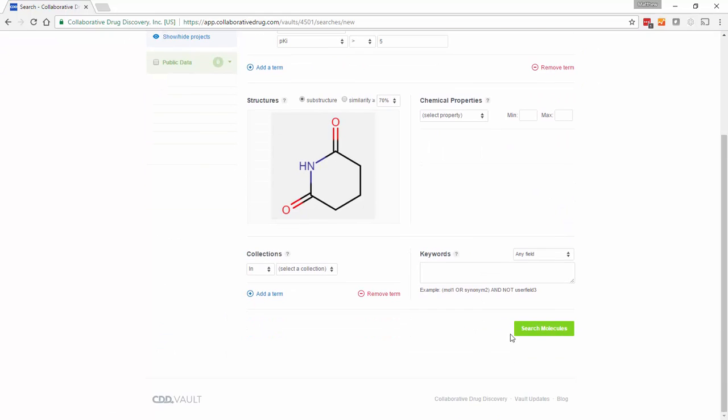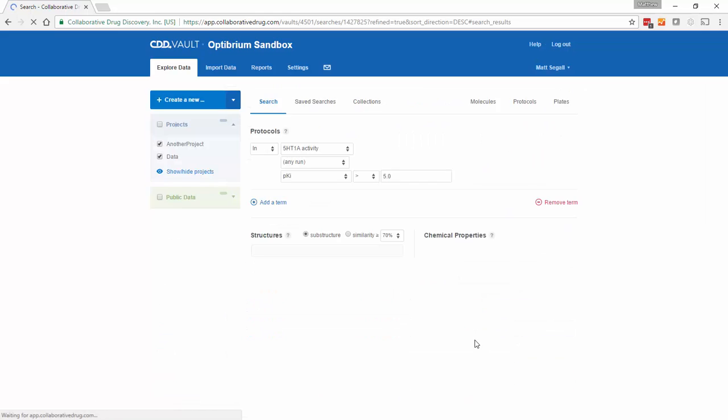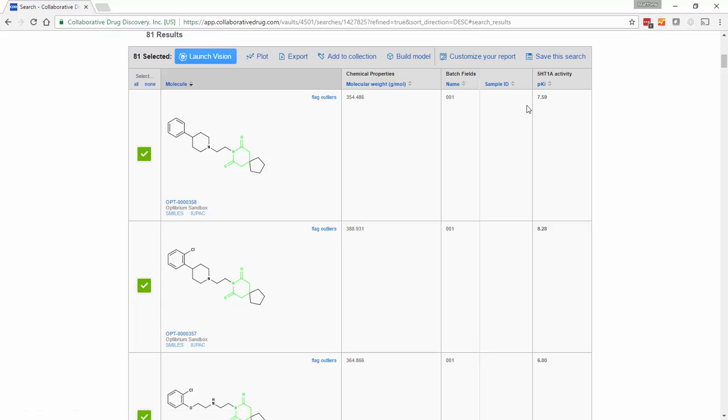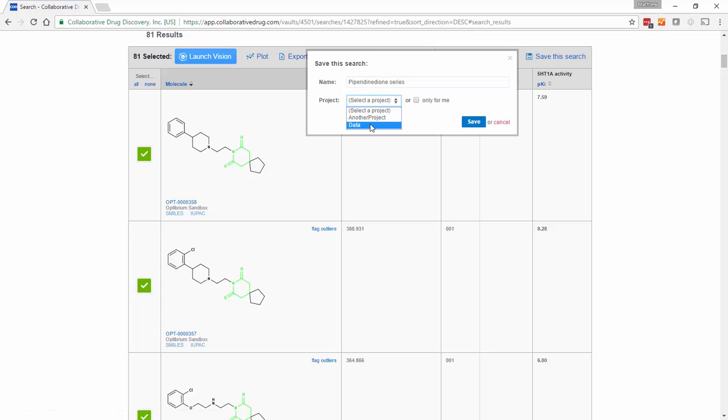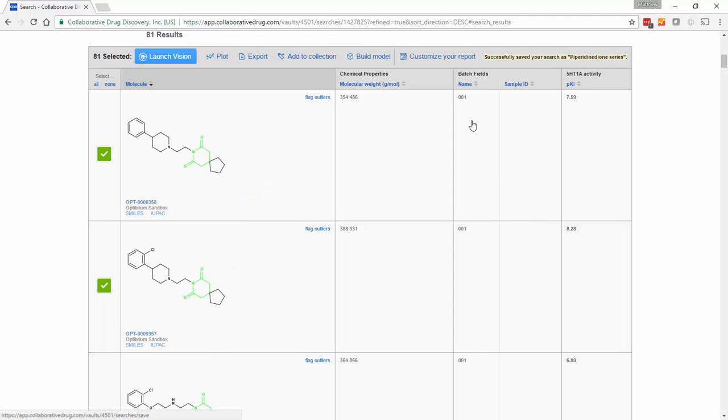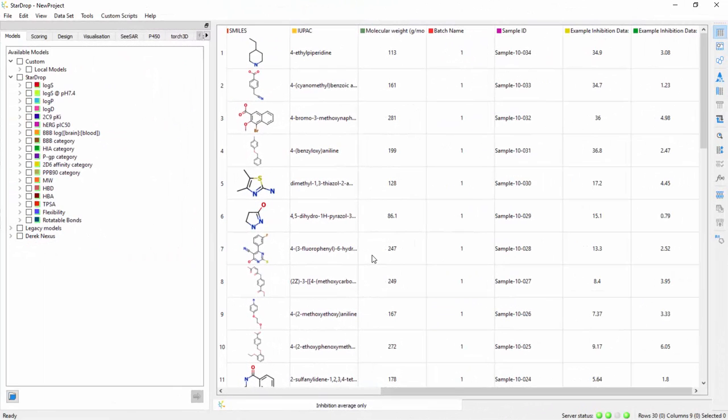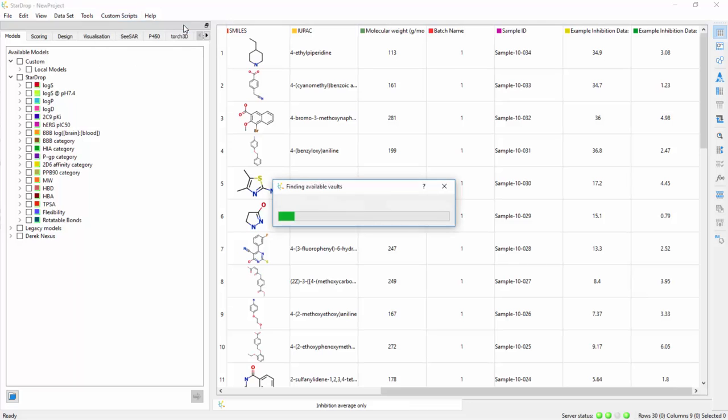If we run this search and then save it within CDD Vault, when we switch back to StarDrop, we will find that it is immediately available.